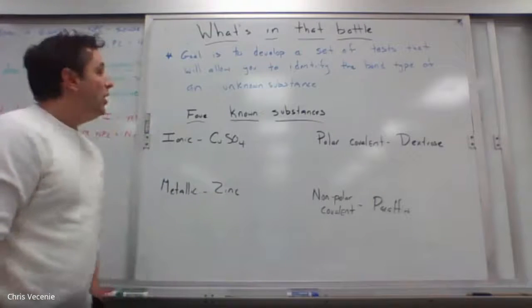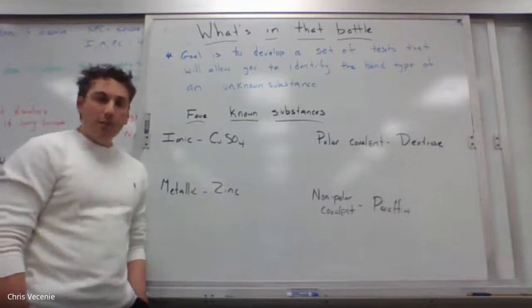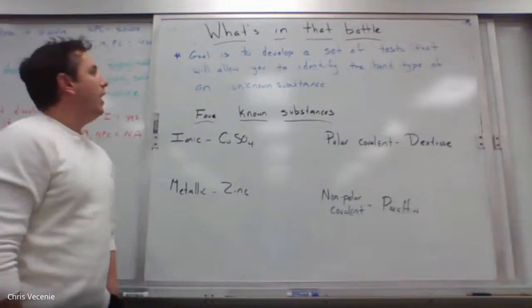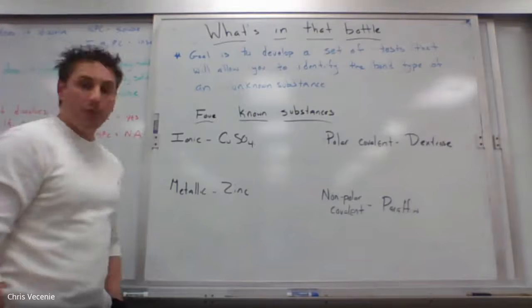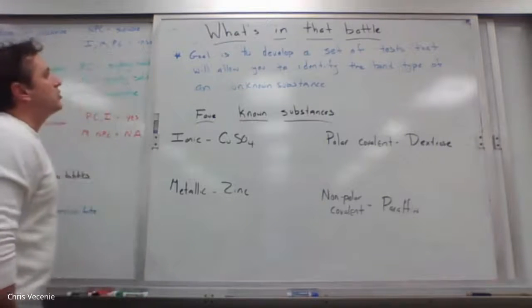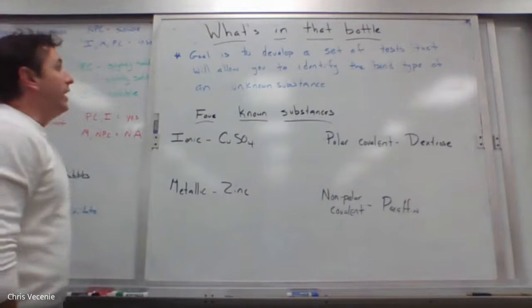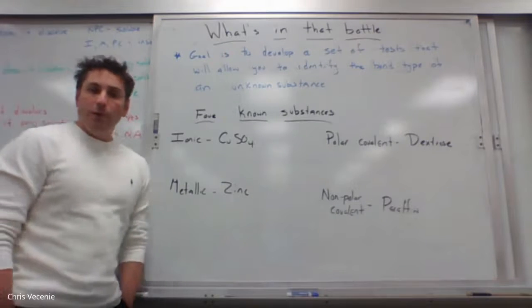Hey, good morning, guys. So, I wanted to set you up for understanding what you're looking for when you walk through this lab simulation. The title of the lab is called What's in That Bottle, and it's pretty straightforward in what it says.